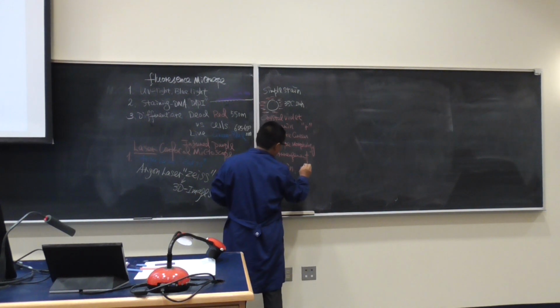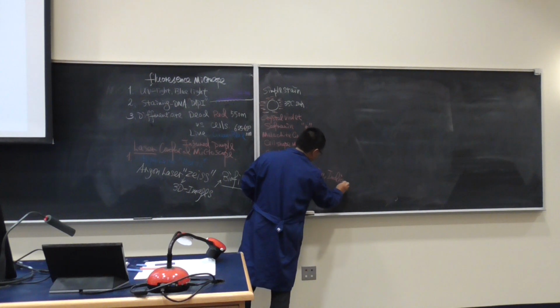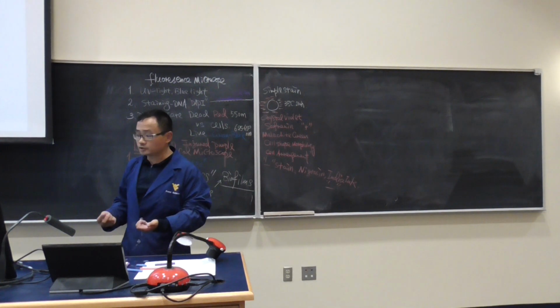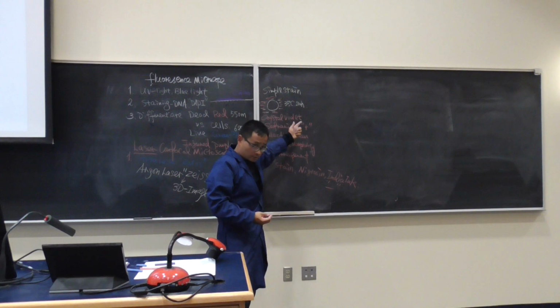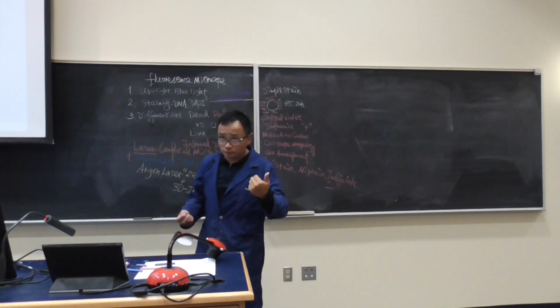Once you do that, you're staining the background, and then the specimen shows up. It also reaches the purpose.